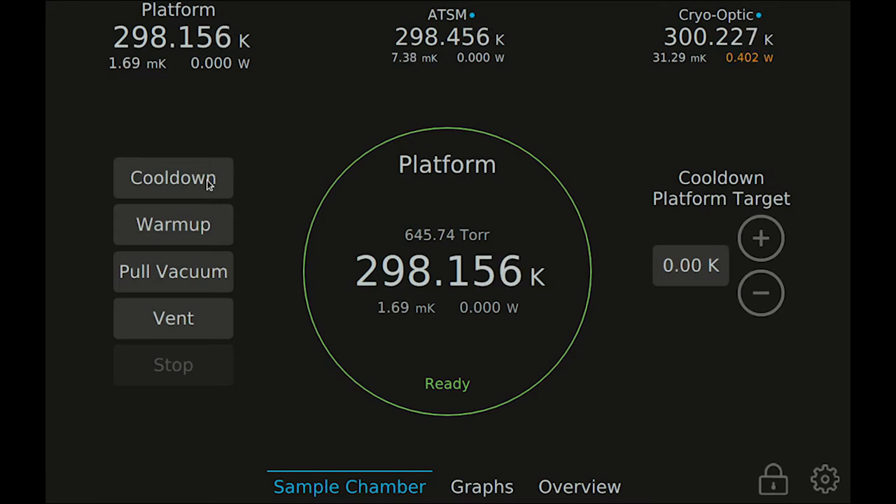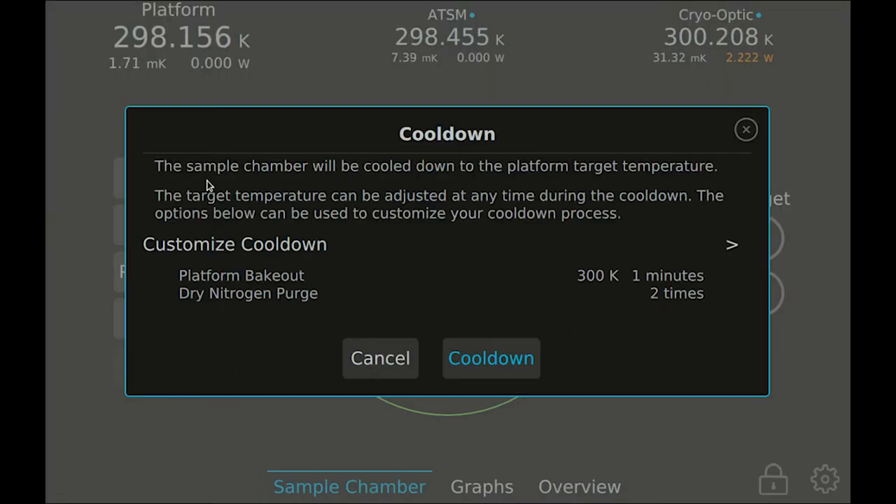Press the cool-down button to bring up the options for customizing the cool-down. This screen shows the current value of each setting. The system remembers the values used in the most recent cool-down. To review or change these settings, press customize cool-down.